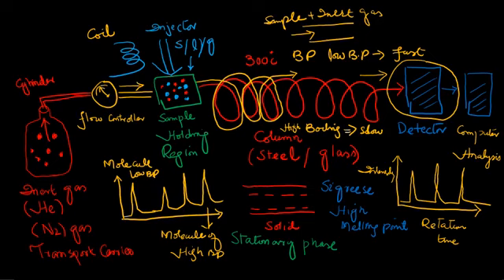So if the boiling point of a molecule is low, then the molecule will remain for a shorter time and the retention time will be less, and we get the peaks of those molecules at a smaller retention time, whereas the molecules which remain for a longer time will have a longer retention time, and the last peaks are the ones with a higher retention time.